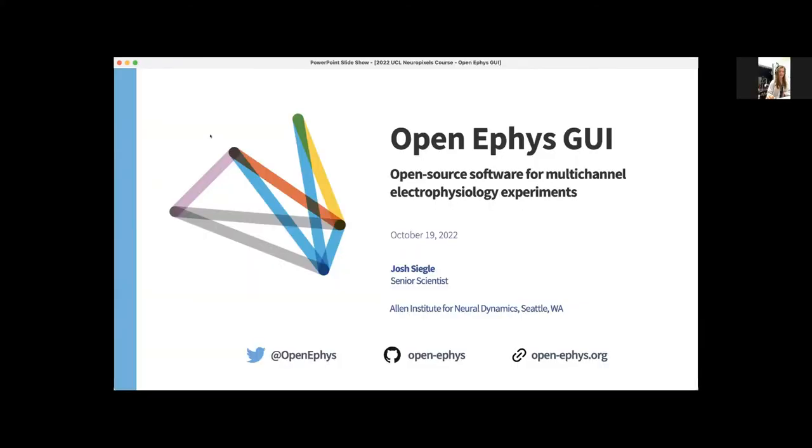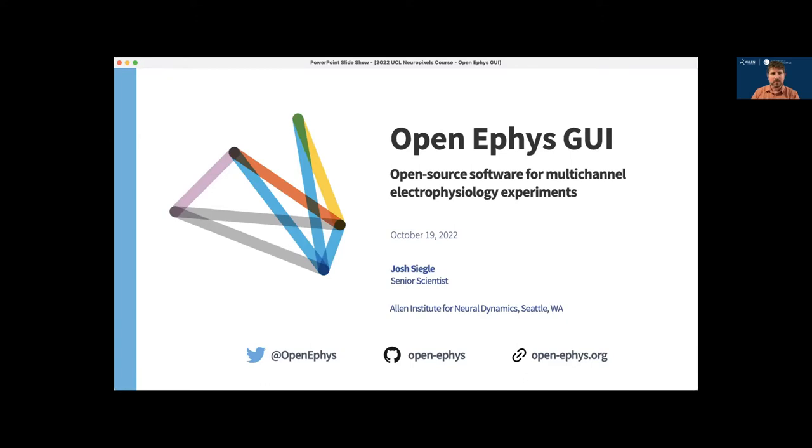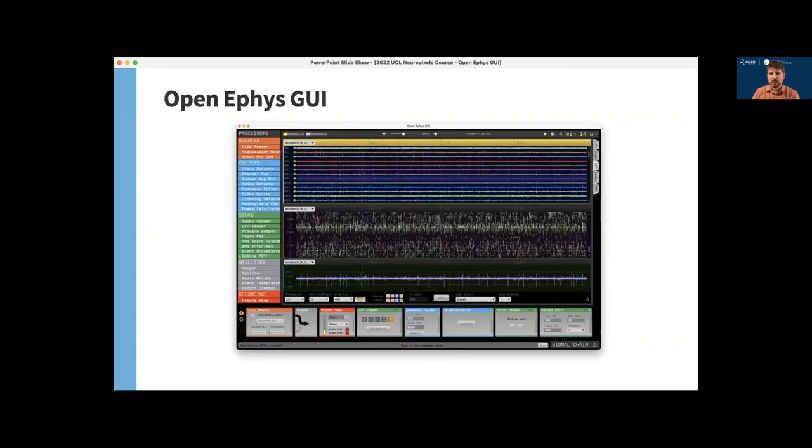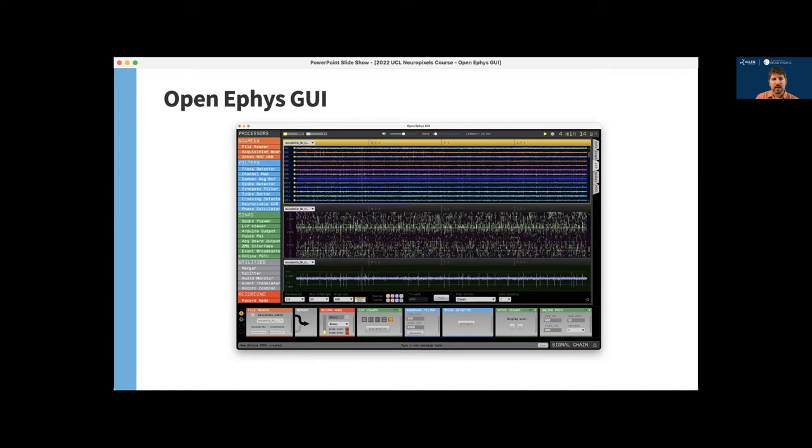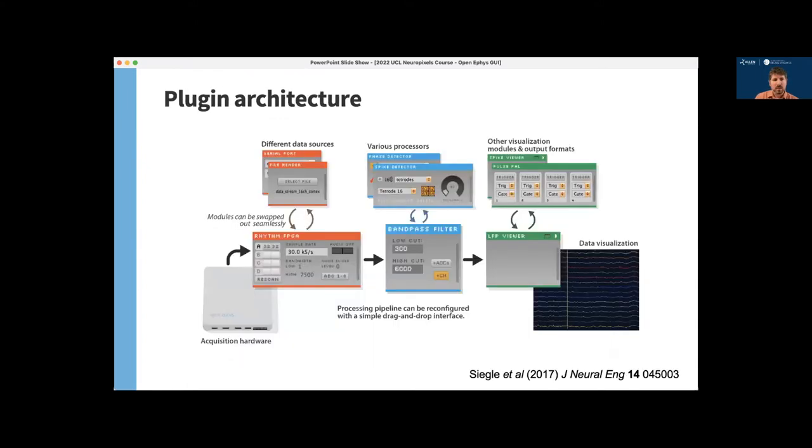All right, thanks a lot. So today I'm going to talk about the OpenEphys GUI, which is collaboratively developed software for high channel count electrophysiology experiments. The primary support team for OpenEphys consists of two full-time engineers based at the Allen Institute. And the source code includes contributions from 46 people all over the world. The core application is cross-platform, but the Neuropixels plugin currently only works on Windows, although we do have a Linux version in the works.